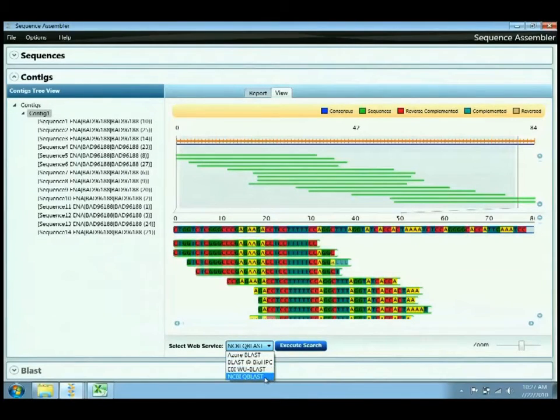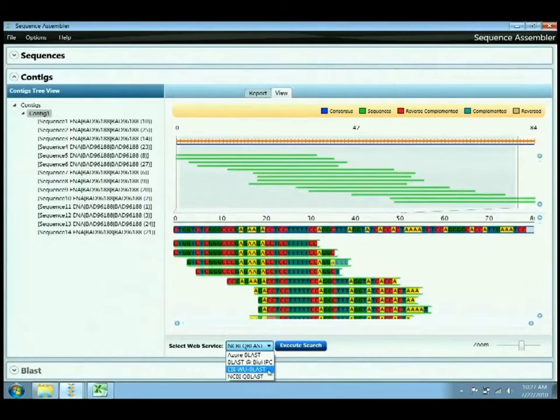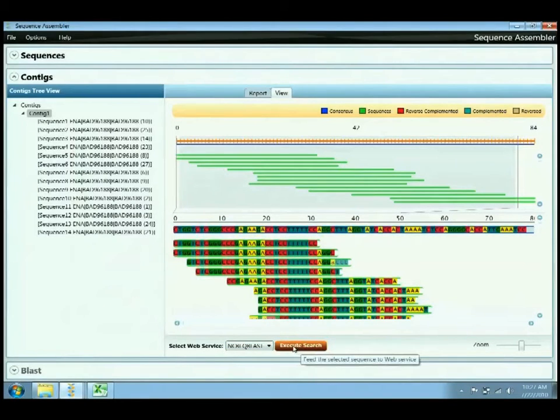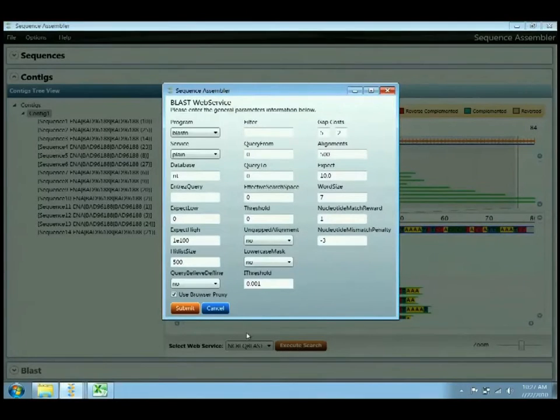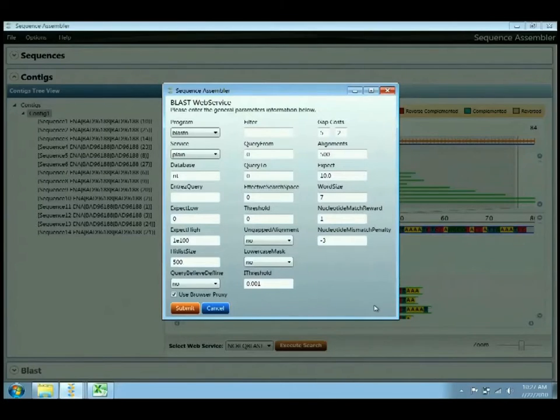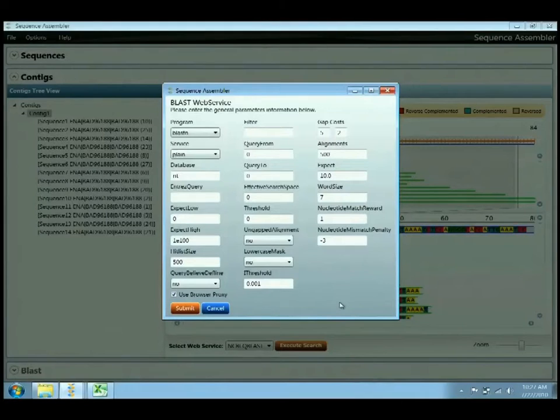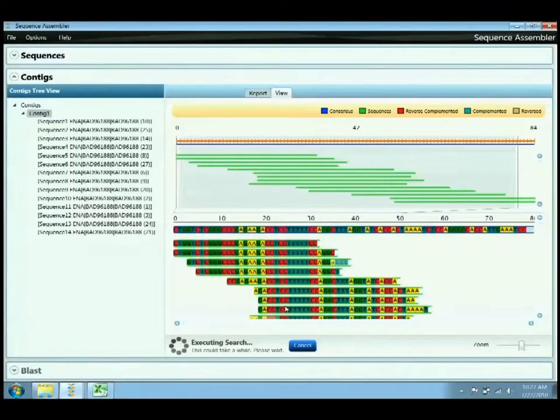We'll select NCBI BLAST, and each of these types of BLAST services have different input parameters, all fully supported in both the library and in the application. In this case, we'll just use the default parameters again. We've tried to monitor what type of inputs are being used and use those as a starting point. And then submit.